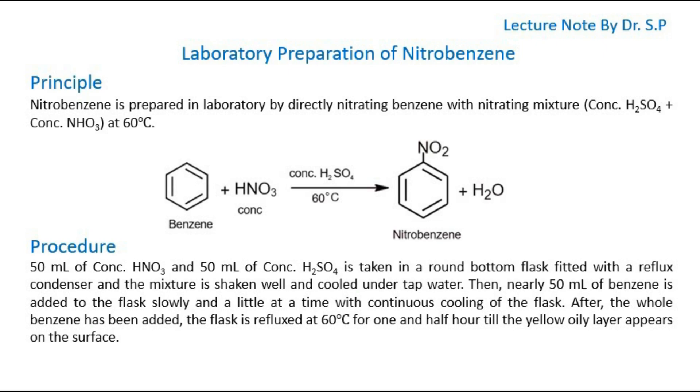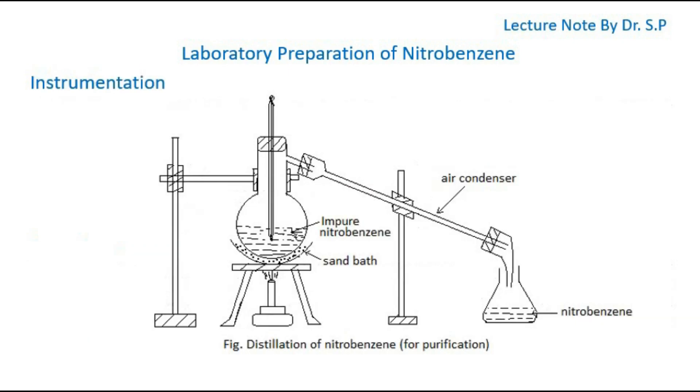After the whole benzene has been added, the flask is refluxed at 60 degrees Celsius for one and a half hours till the yellow oily layer appears on the surface. This is the instrumental setup for preparation of nitrobenzene.